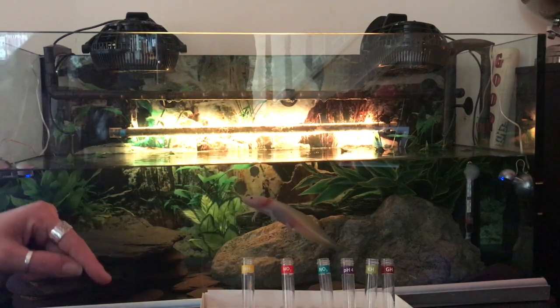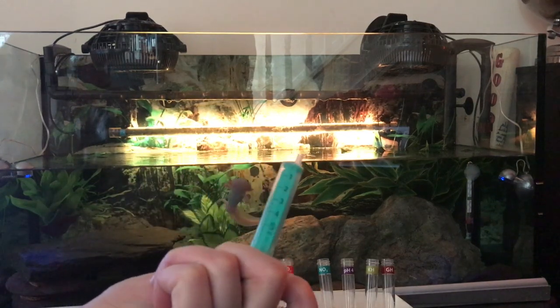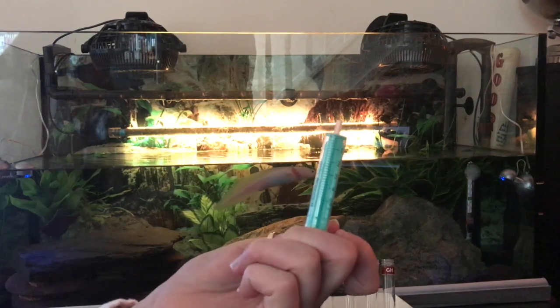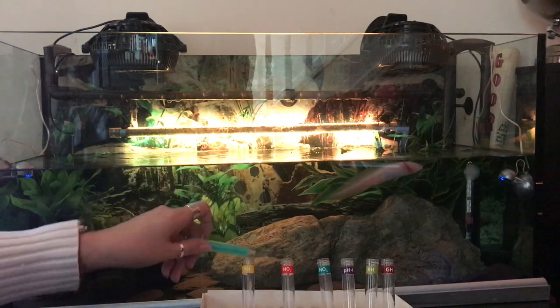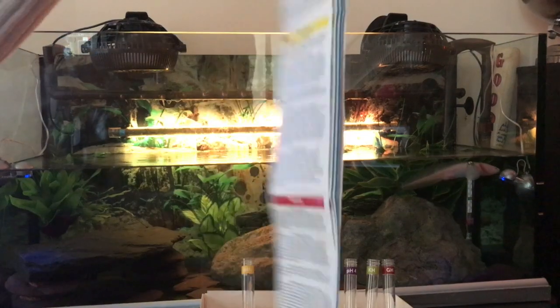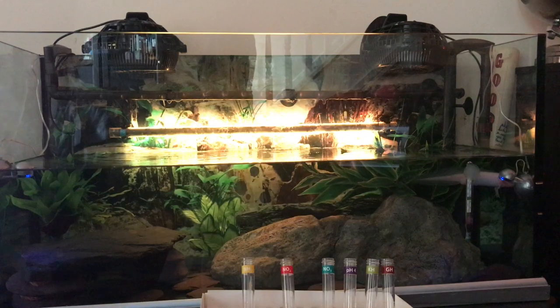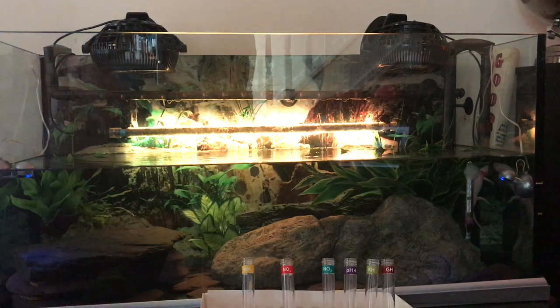I'm going to do a water test now. It comes with a syringe, which you use to get your tank water out — it's about five mils usually for each test. It's dead simple and straightforward. You just fill each of these tubes up, and then using the instructions that it comes with, you do the corresponding number of drops in the tubes. I'm going to test it and let you see some of the colour changes happening within the test tubes.